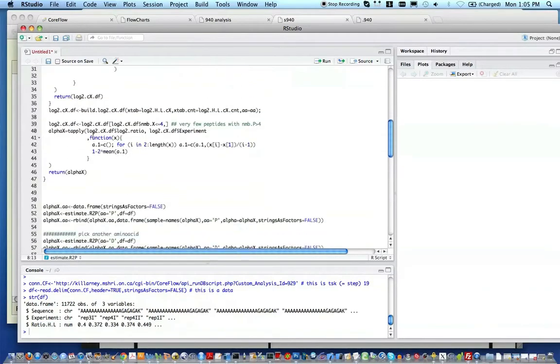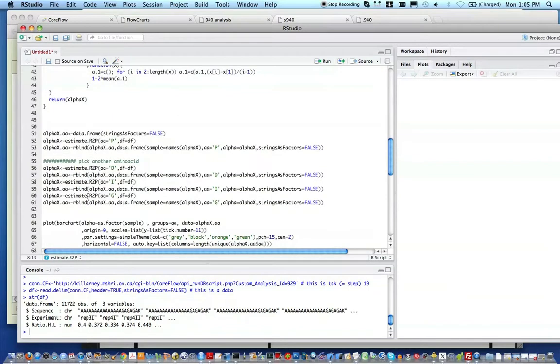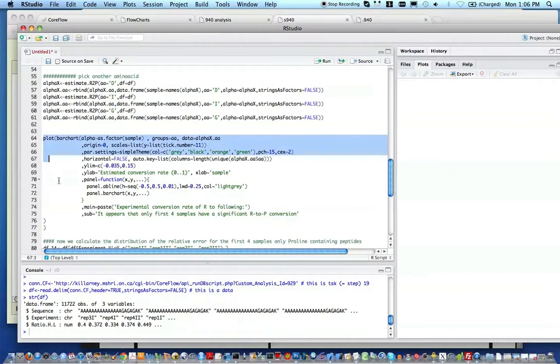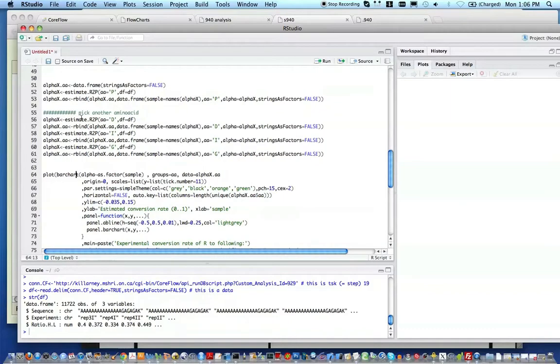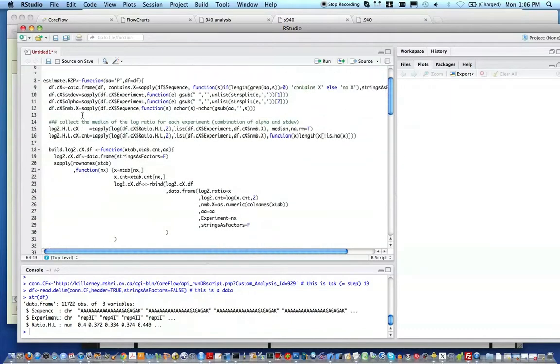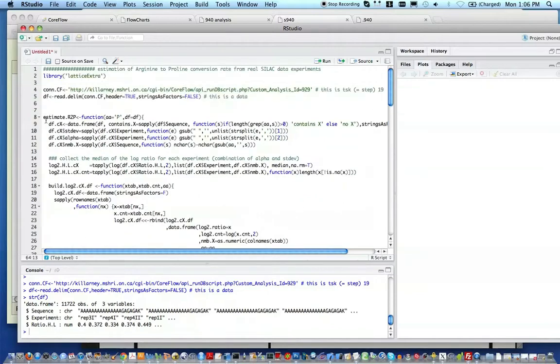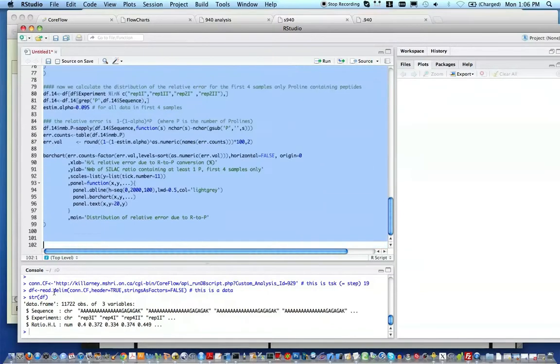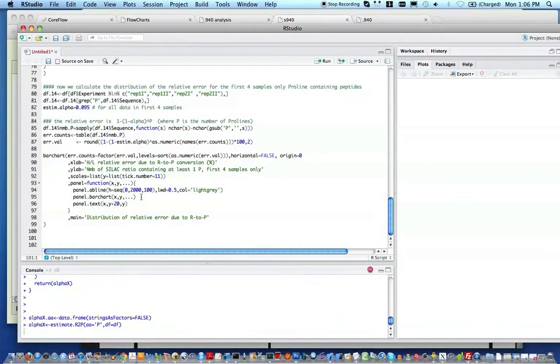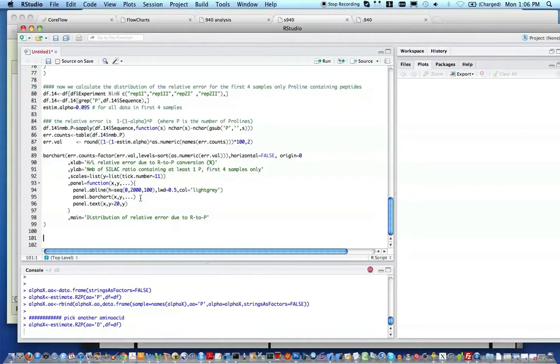And then, of course, I can draw some plots. For example, here is how, in the R language, I can show a plot in a bar chart format. Basically like running everything else. So this is what I'm going to do. I'm going to run this particular function that is defined and everything else that is here, and I'll see what I can obtain in the end.